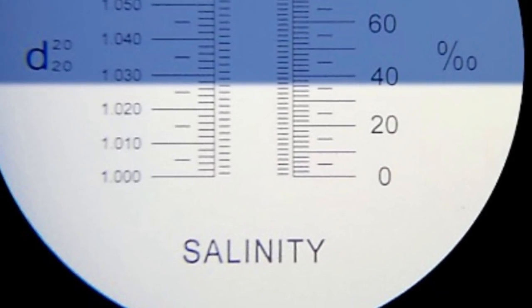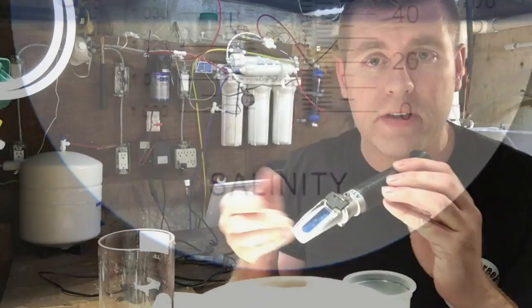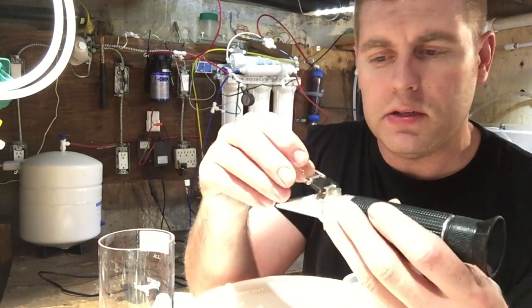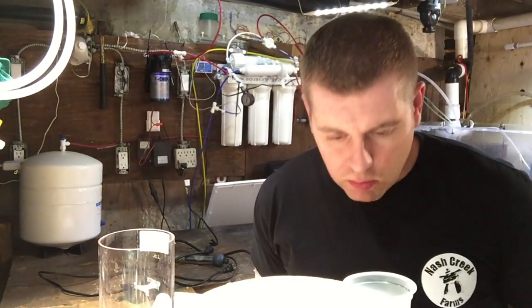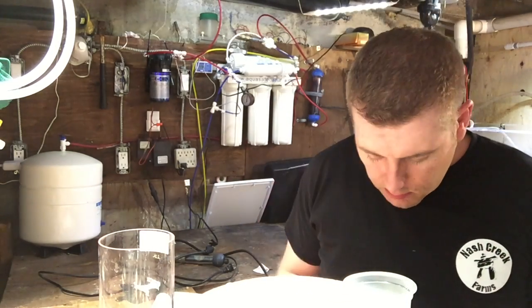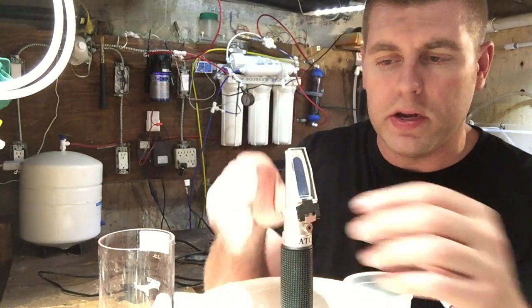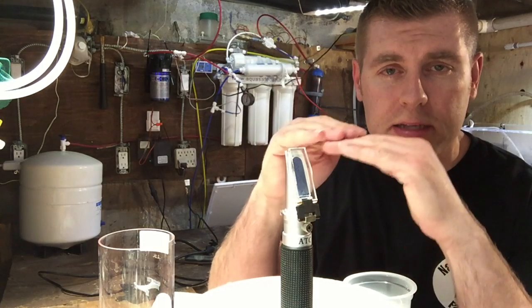Make sure you always clean this off with RO water when you're done. If you don't, you can get rust and corrosion — you don't want that. You spent good money on your equipment, so look after it. Use distilled water or RO water to wash it off. It's very important, as soon as you get your refractometer out of the box, to calibrate it. Make sure the blue line and white line meet at zero.